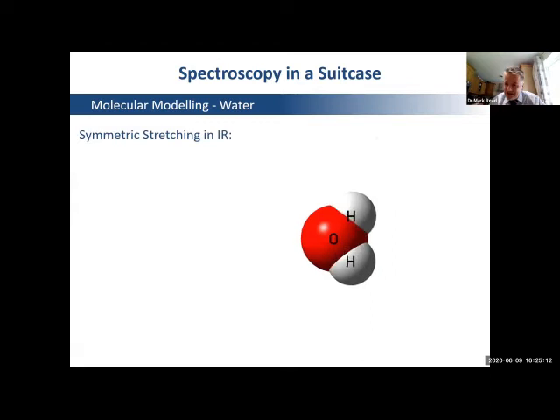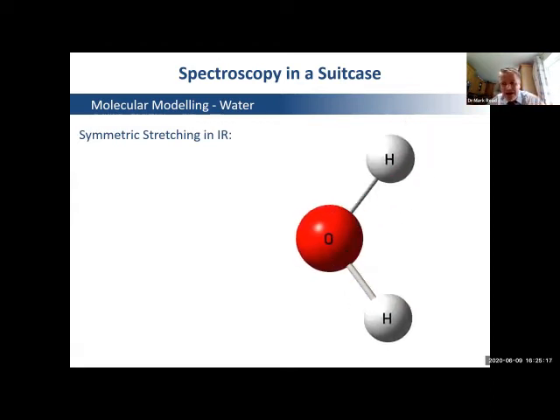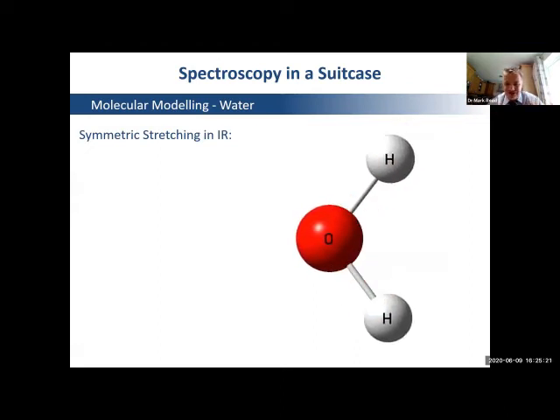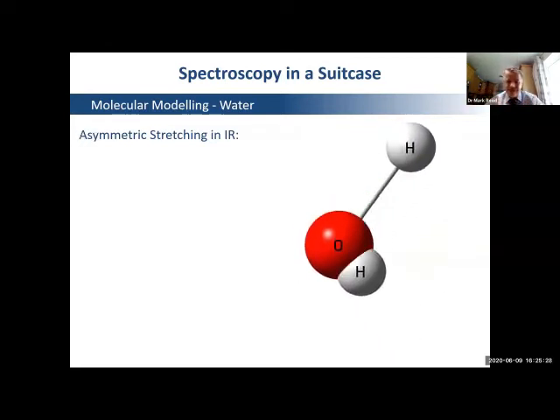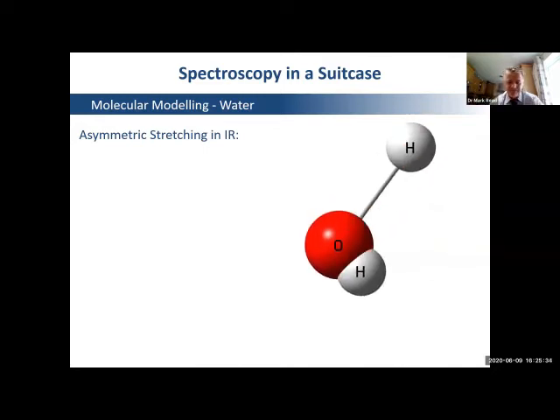There is another slightly different wavelength which causes the stretching mode. And in here, both of the hydrogens are moving away at the same time. So that is a symmetric stretch. And as the name implies, you can also get an asymmetric stretch as well, where they are out of phase. So all of these take slightly different wavelengths of energy, so the peak will shift slightly.